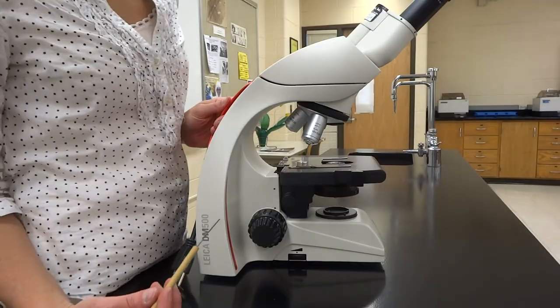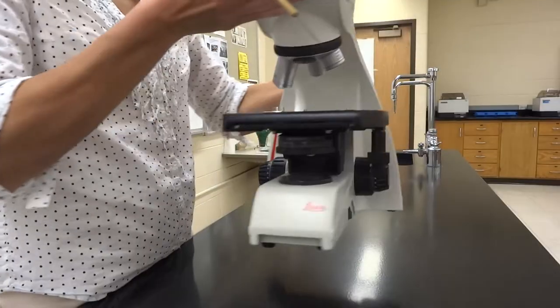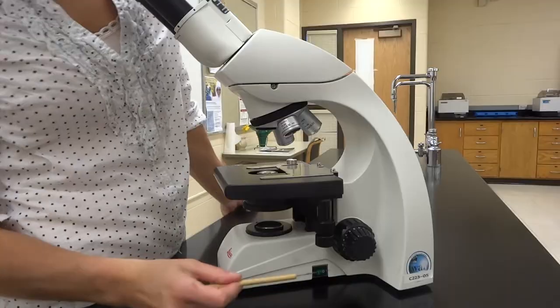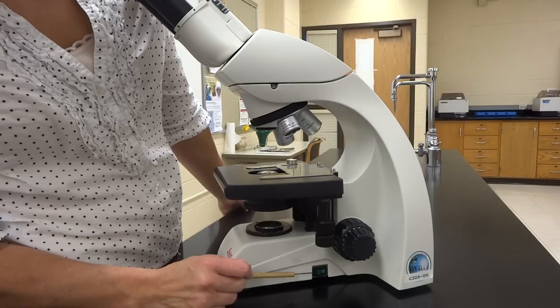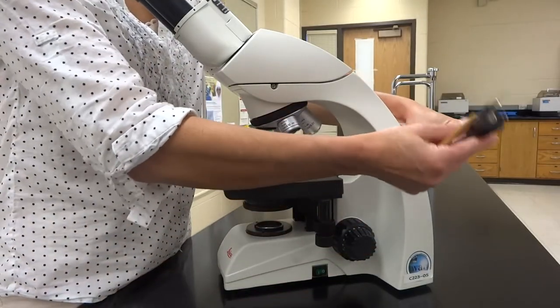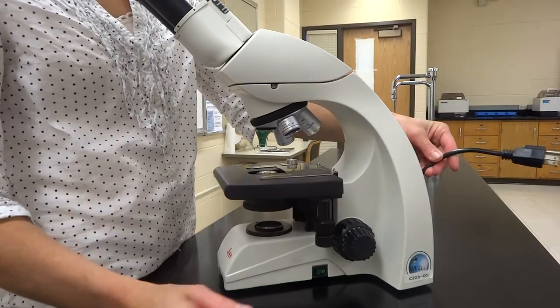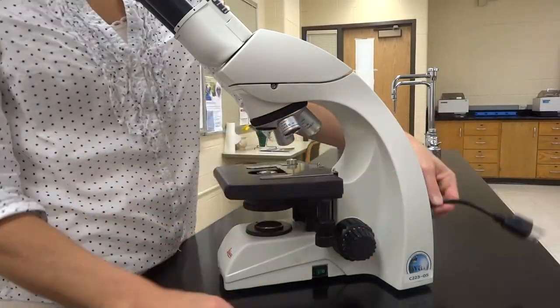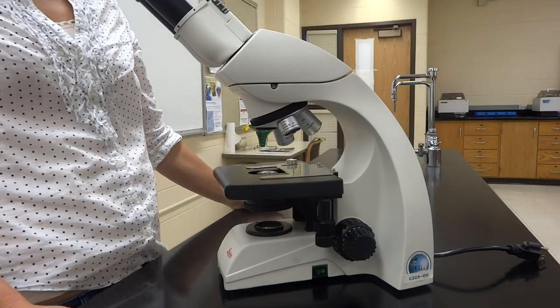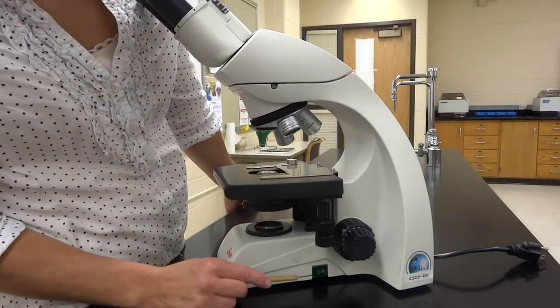Down at the bottom on the same side as the rheostat is your on/off switch. This is important — when you plug in your microscope with the plug on the back, make sure it's actually on. It's a common experience to watch people say they can't see anything, and the answer is simply that the microscope isn't turned on. So the on/off switch is a very important part of your microscope experience.